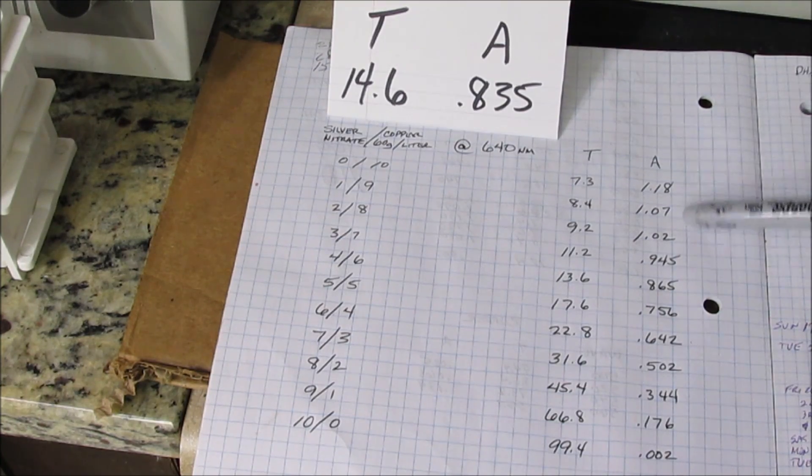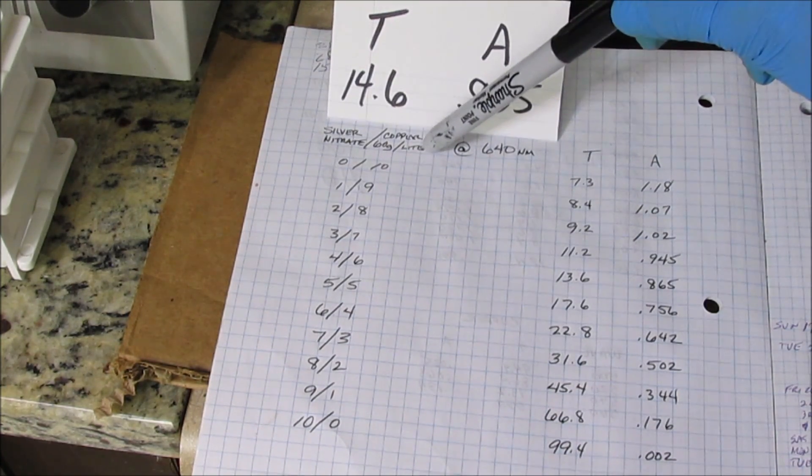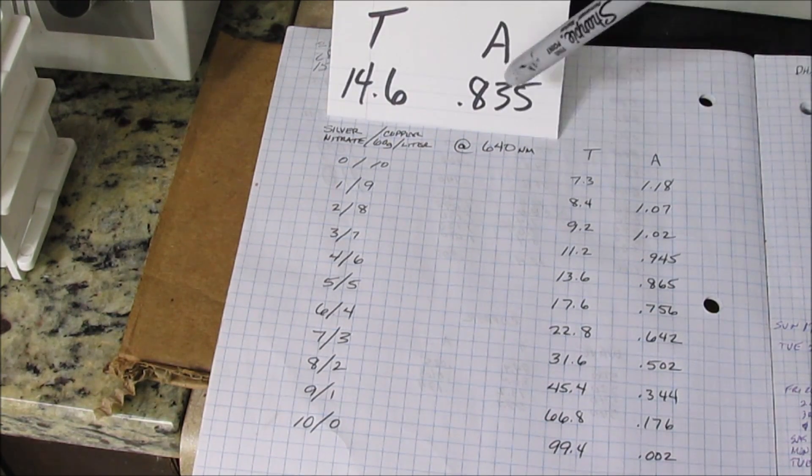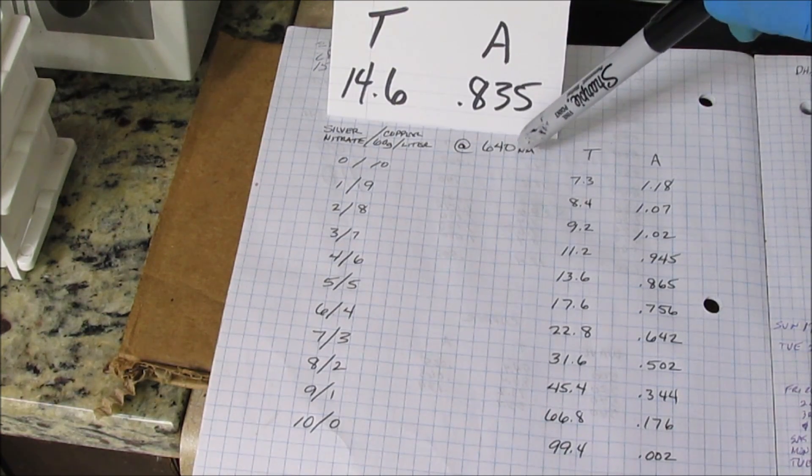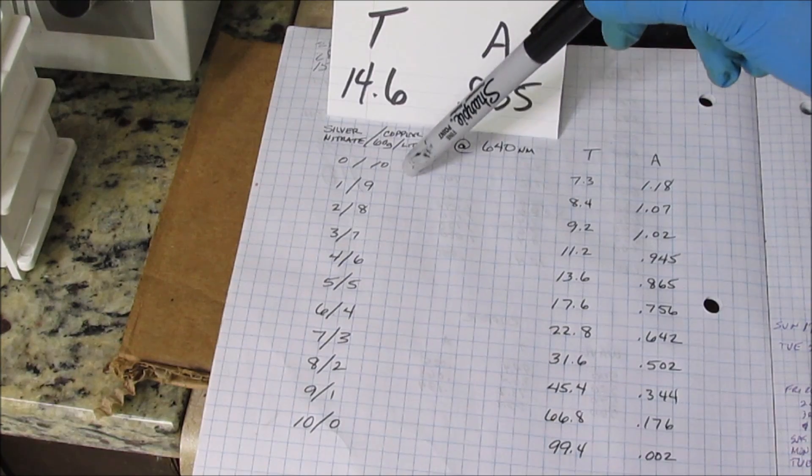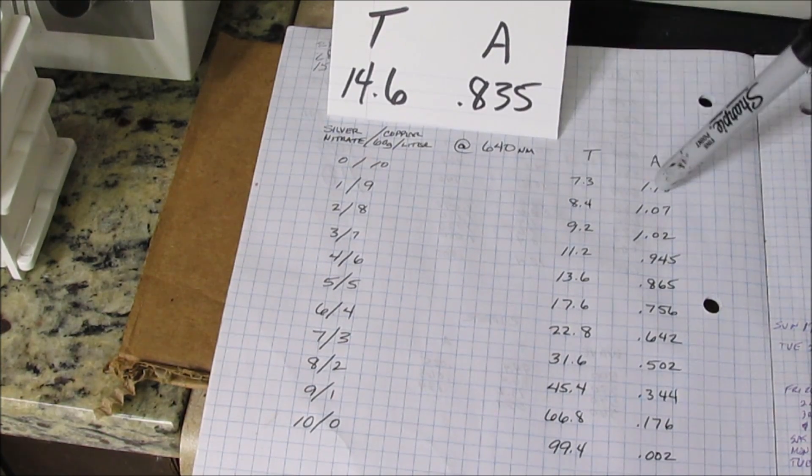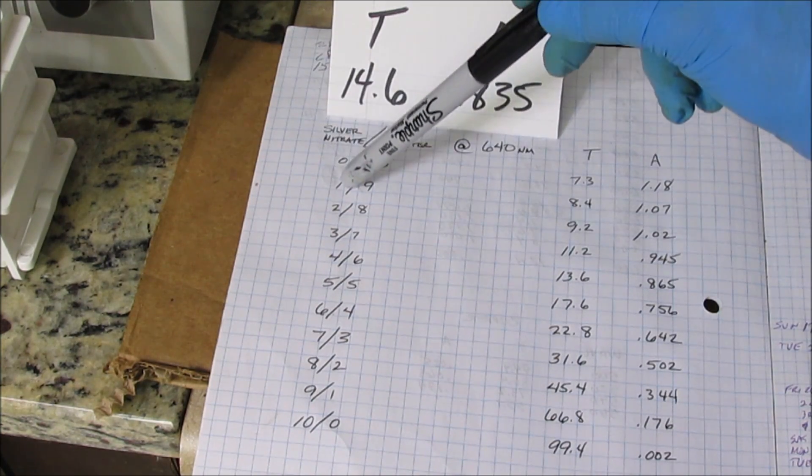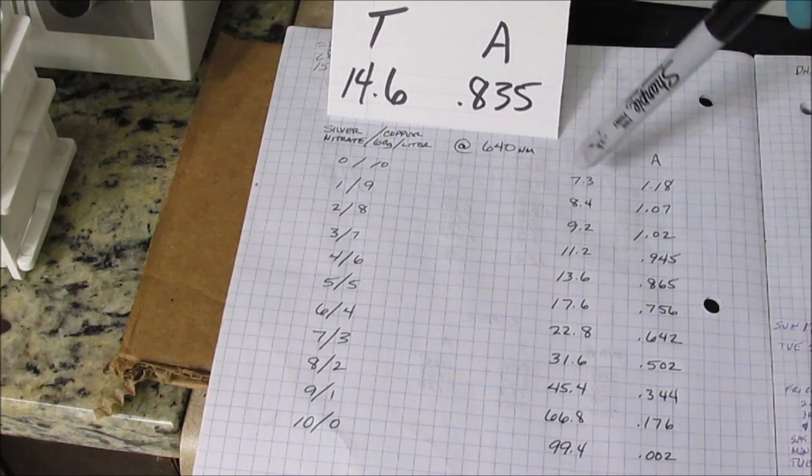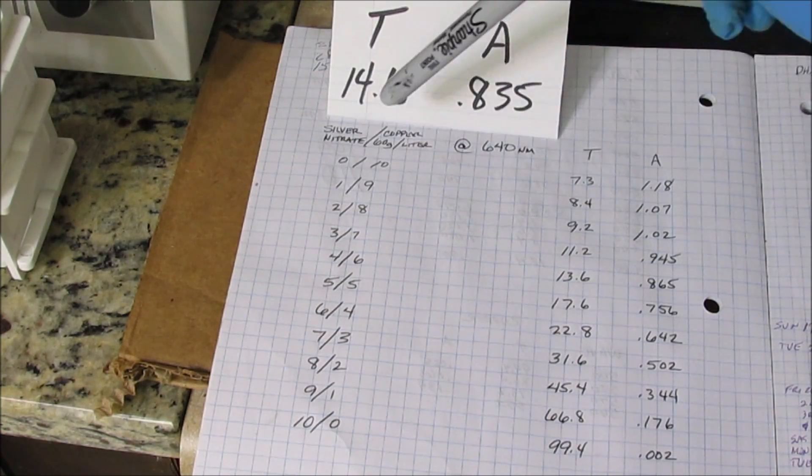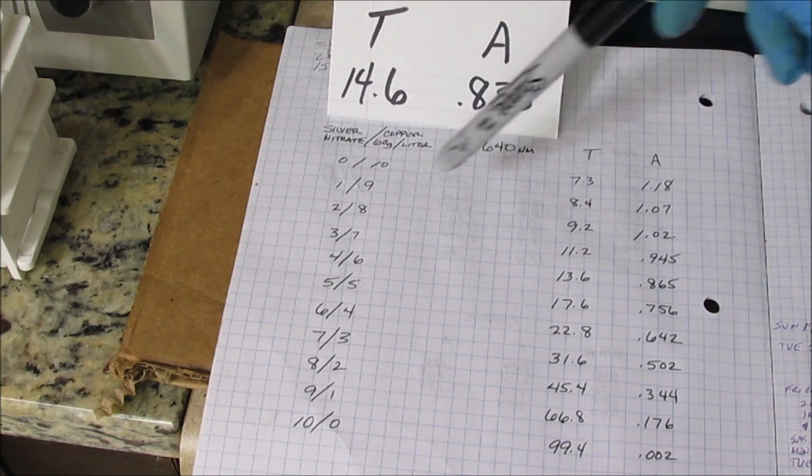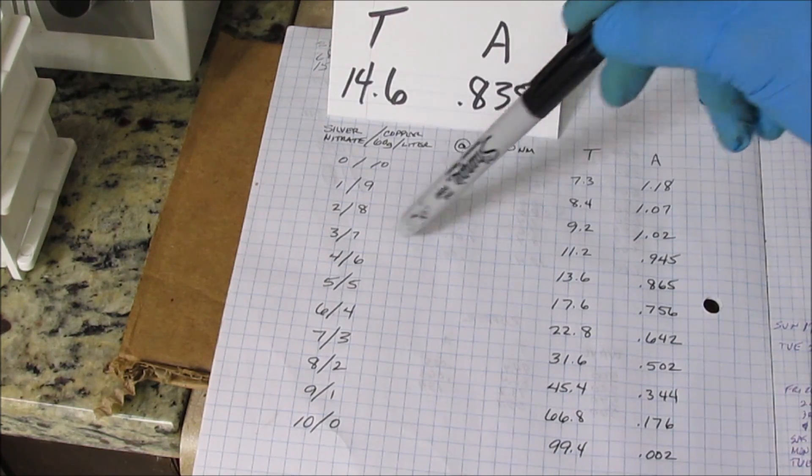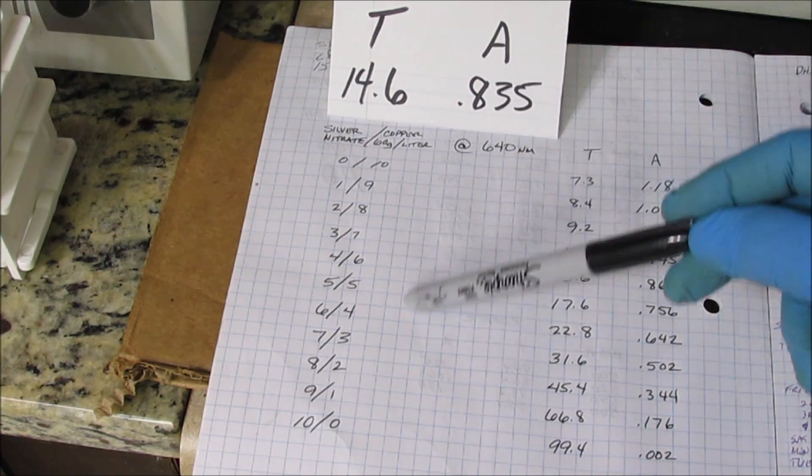Here's the chart that I prepared ahead of time using 60 grams of copper dissolved in 1 liter of solution and silver nitrate. I set the wavelength for 640, then put a sample in that was all copper and got these readings here for transmittance and absorbance. Then I put solutions in with different ratios: 1 part silver nitrate and 9 parts copper, then 2 parts silver nitrate and 8 parts copper, 3 parts silver nitrate and 7 parts copper, and so on down the line.